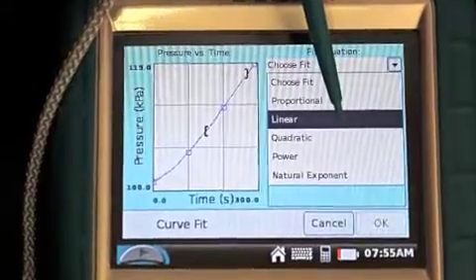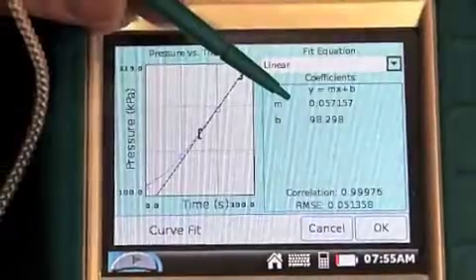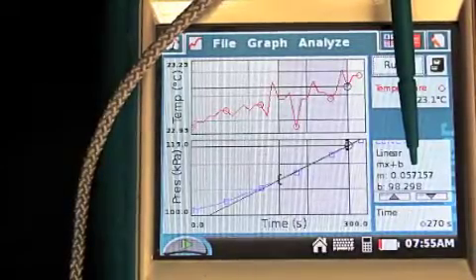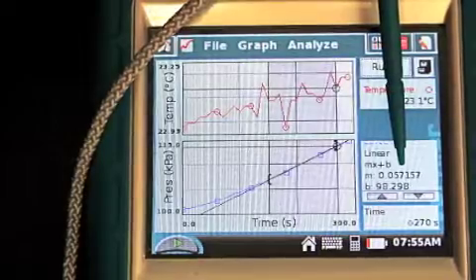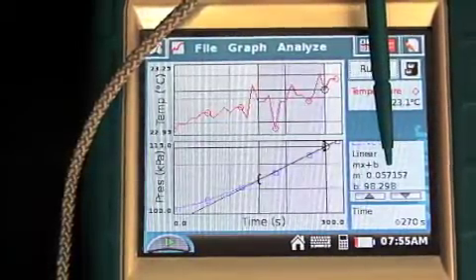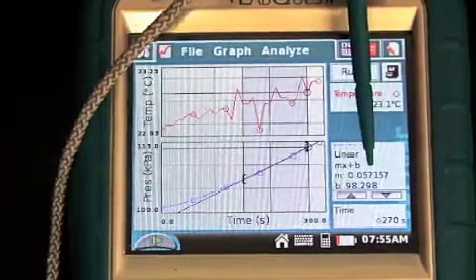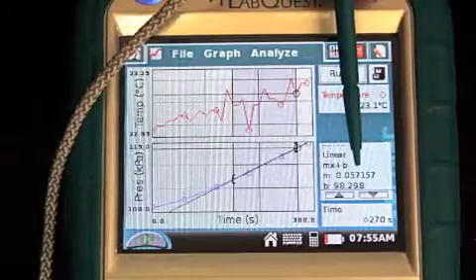And as soon as you release the stylus, the LabQuest is going to analyze the data and tell you what the slope is. Once you leave the Curve Fit screen, the LabQuest will still remember that you were after what the linear value was for the slope of that line, and you can pull it back up on the right-hand side of that menu. Remember, the slope of this line is the rate that the pressure was changing per second for the oxygen. So it is the rate that the oxygen was being produced in the unit of kilopascals per second.